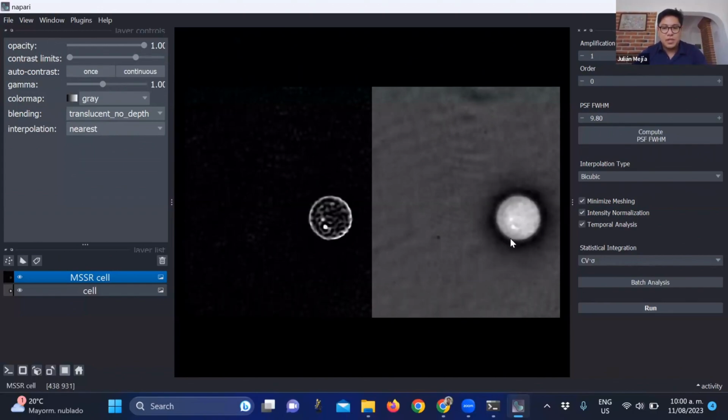This is amazing to me, because when you see the MSSR result, you see, okay, you have this point in here, you have this section that is darker. For instance, this really dark section now becomes really clear in the original image. These bright points surrounded by these dark areas are now really clear. You can match structure that you couldn't see before.